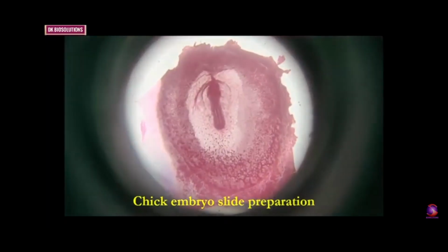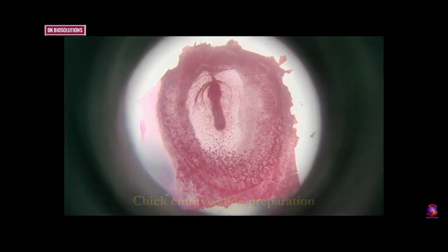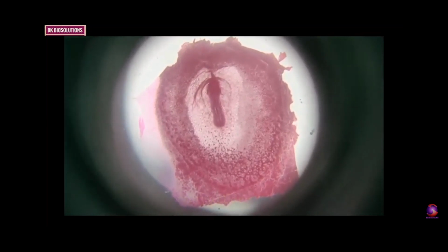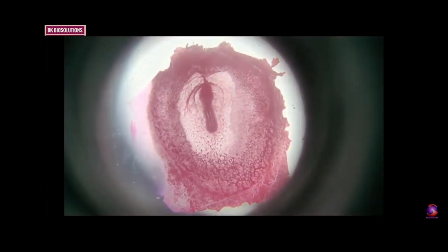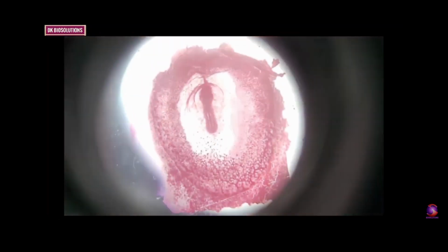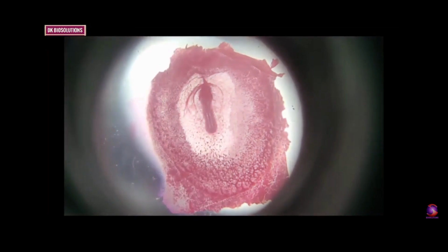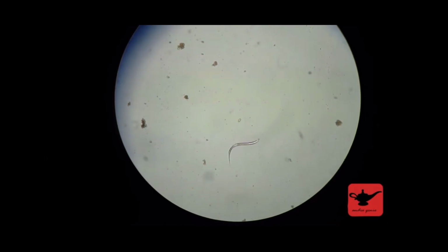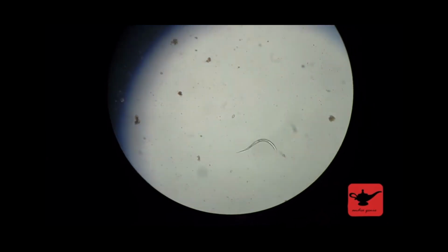Because of the high refractive indices of most reagents used for de-alcoholization, tissues, particularly embryos and parasites, become transparent so that the internal structures become visible to the naked eye. This is due to the property of making tissues transparent. Solutions utilized for alcohol removal are also called clearing agents. But not all clearing agents, however, exhibit this property.